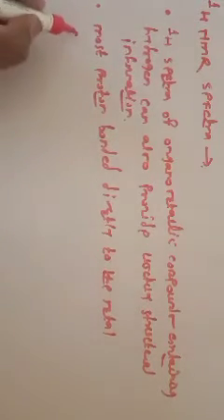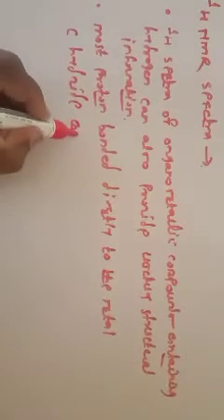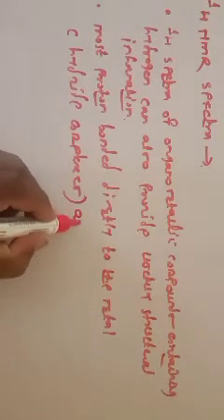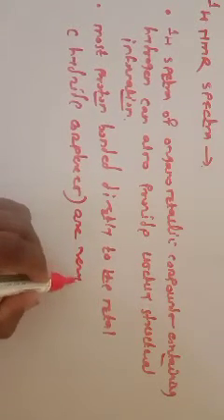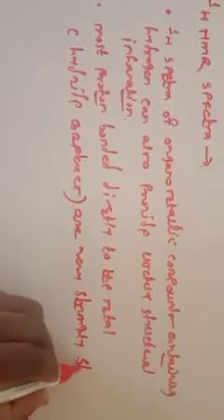Whenever the proton is directly bonded to the metal, the complex is considered a hydride complex, in which the proton has a negative charge. The protons bonded directly to the metal atom in hydride complexes are very strongly shielded.